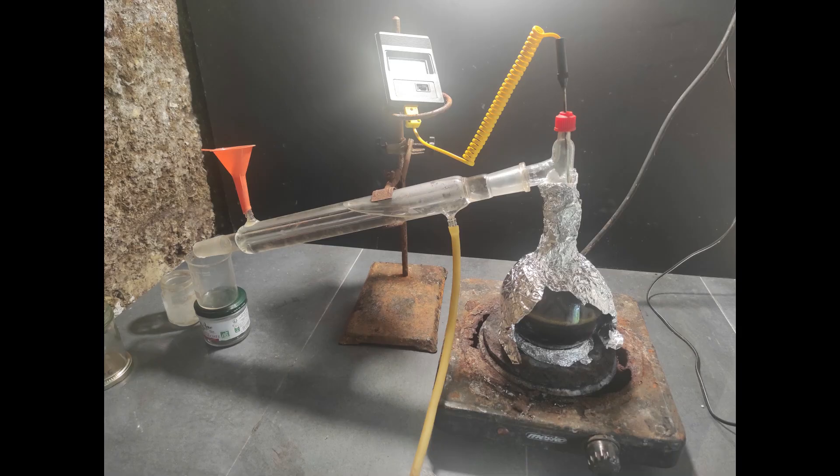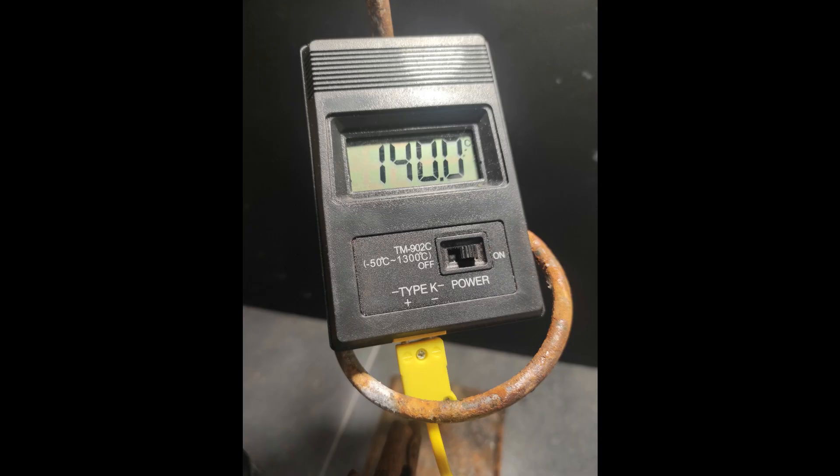For the second distillation, we can use glassware because it shouldn't be too extreme. I collected the fraction between 140 and 150 degrees Celsius, which should be mostly styrene. I did a quick overview of this process because I did it a long time ago, but let me know if you want a full video about it.